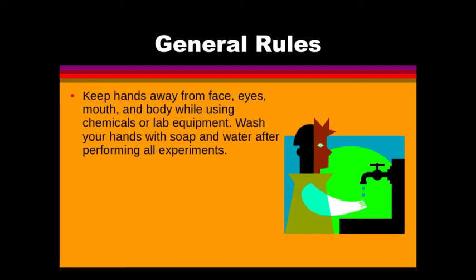Keep hands away from face, eyes, mouth, and body while using chemicals or lab equipment. Wash your hands with soap and water after performing all labs. That's why we have sinks in our room.